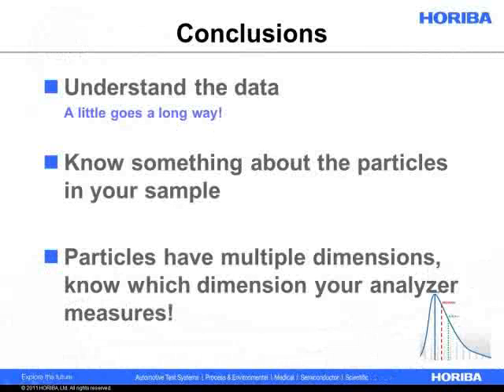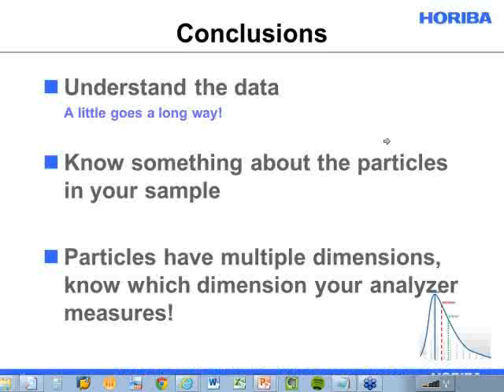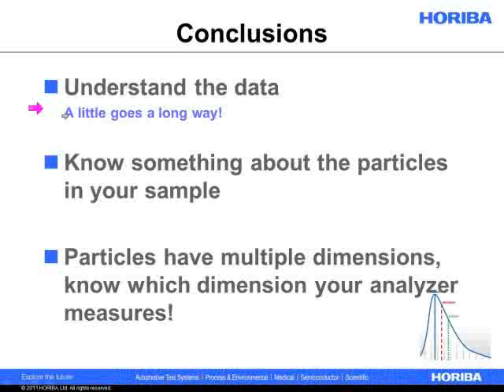So some conclusions from this section. Understand your data. You don't have to be an expert in the data, but a little bit of understanding goes a very long way. I would ask that you try and find something out about the particles in your sample, just like I was describing, I asked the chemists in our applications lab. It doesn't take that much effort, and it may or may not be useful, but 5 minutes of effort could tell you something very interesting.